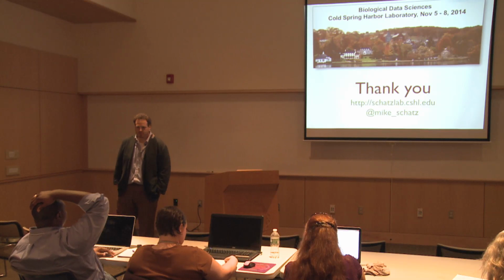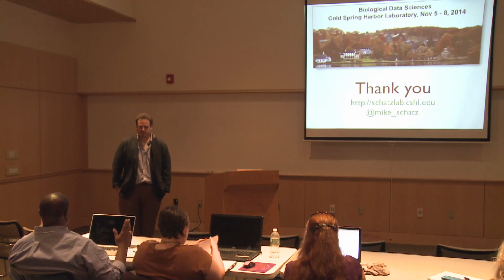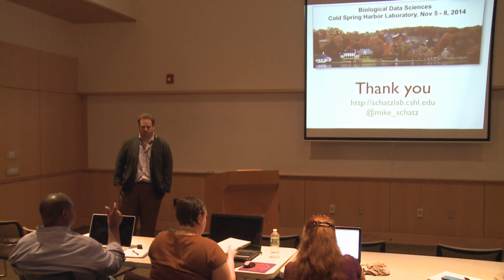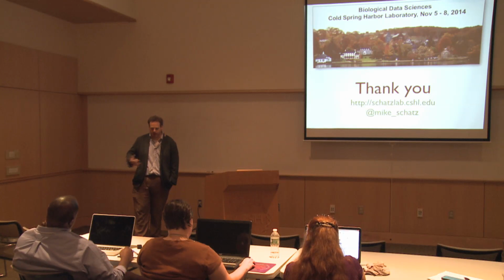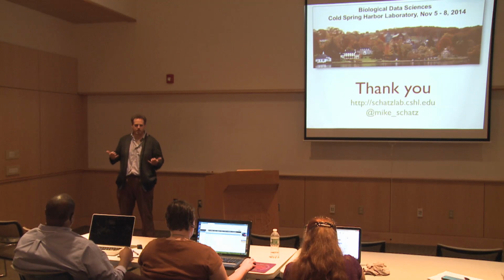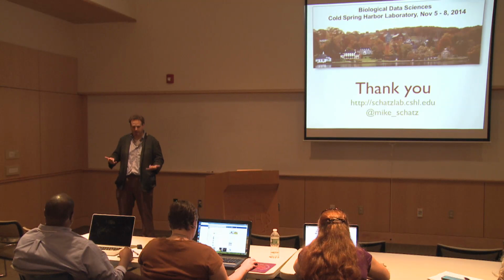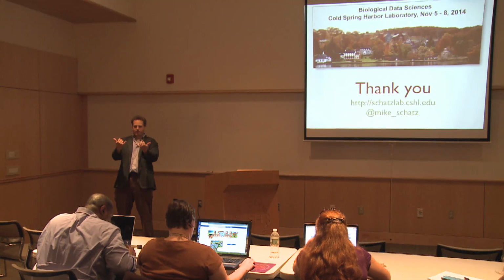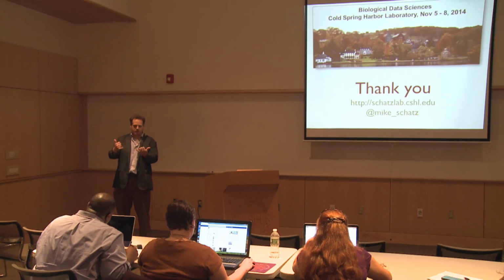Is it possible to combine both, like the long read PacBio at some low coverage to be economical, and then fill in with shorter reads? Yeah, that's very much the research frontier: what's the right way to put these different data together. You have a few options. If you have a pretty good Illumina assembly to start and you just want to improve upon it and close the scaffold gaps, there's a nice pipeline from Baylor called PBJelly, a play on PacBio. PBJelly does exactly that: you have scaffolds with a gap in the middle, and you map relatively low coverage of PacBio reads to fill in the spacing there.